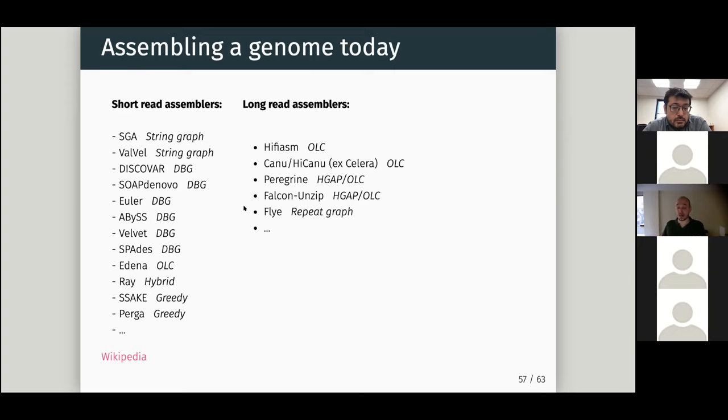If your reads are much more accurate, which is the case of Illumina, or in the case of HiFi reads from PacBio, where you have this circular consensus that took care of removing most of the errors, then what happens is that you don't have to compute all the overlaps. When at some point you get to 2% difference between the two reads, you say, okay, no, I'm not gonna compute any further because these two reads belong to two different regions, okay? Because they overlap after, let's say, just 2% of errors. It's not to be considered a real overlap, but just a spurious overlap. So that's why instead of taking days to assemble a genome of a human size, HiFiasm can take a few hours or even less if you have a lot of compute power available.